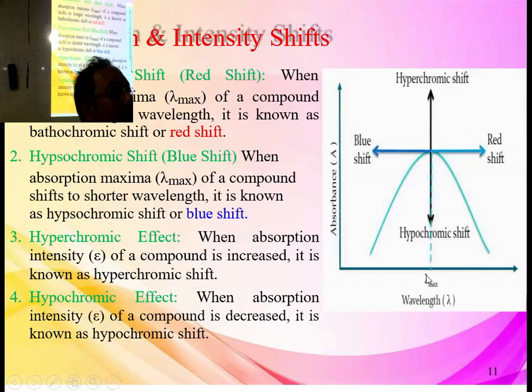Got the idea of lambda max? So every molecule having a particular lambda max will give us the idea about the molecule. That means if you get two similar plots, one known and another an unknown solution, you can guess what solution it is from the peak position itself.